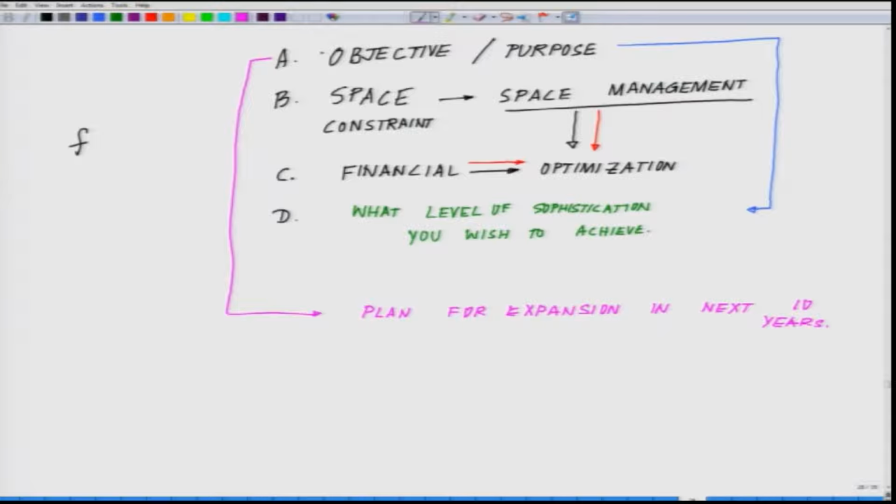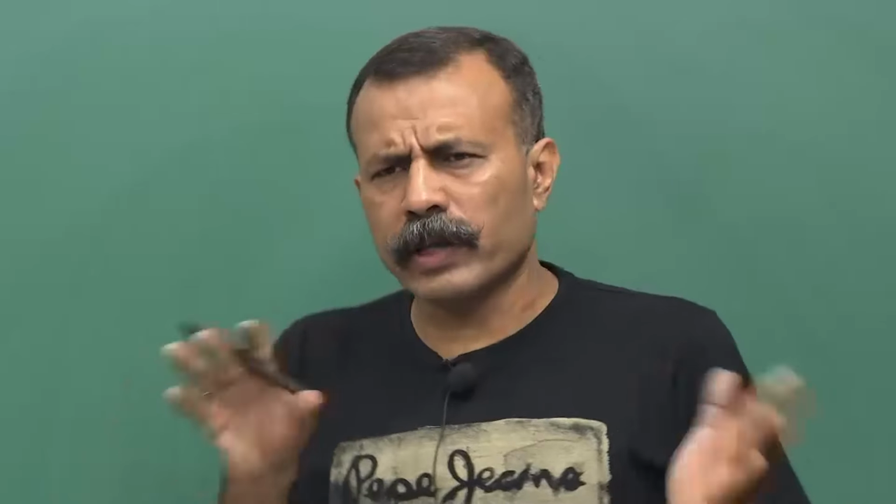Because unless you have a very clear cut plan, this is how you want to explore. Or say for example, you are not very sure. Suppose you are a new faculty starting something, you are not very sure. Yeah, I may do this. I mean, that happens with all of us, right? When I set up my lab, I still remember. And as a matter of fact, when I set up labs for my employers, I always told them this simple thing: at this point, I do not know, I may love to explore this area. So you do not consume the whole area. You kind of cover the area in some way or other. It should not look like you are not utilizing that area, but you should have a buffer space.